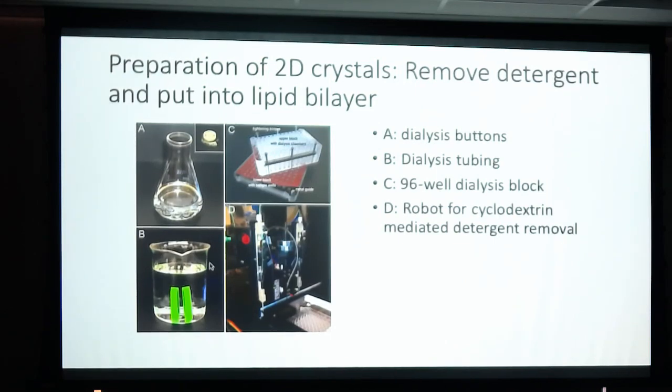And so that was, like I said, very laborious. For every condition you wanted to try, you had to have a different solution. Even if you wanted to do 8 or 10 trials, that would be 8 or 10 buttons, or if you're dialyzing into different solutions or different buffers, you'd have to set all this up, and then you'd have to screen it afterwards. So it's quite a bit of work.